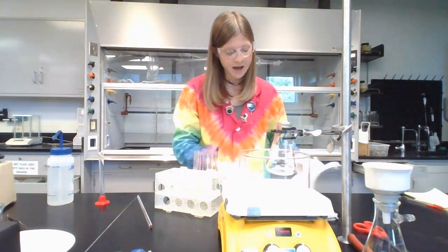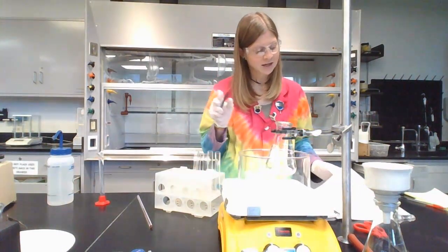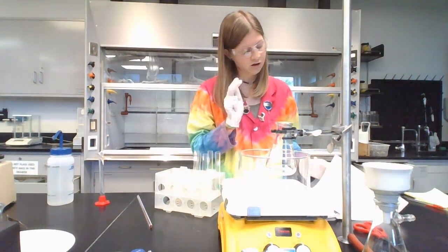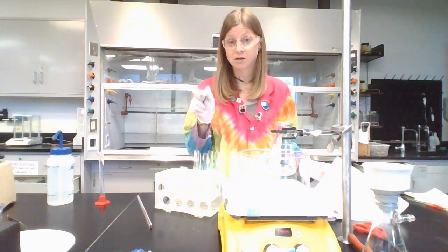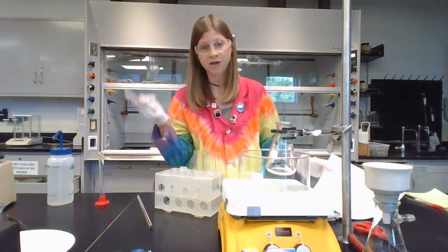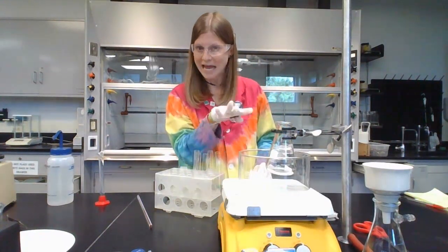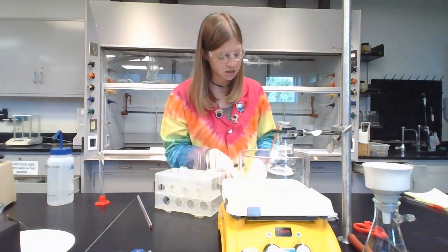So you're going to record that in the phenol test, the color of pure salicylic acid plus FeCl3 and the color of pure aspirin plus FeCl3. The third color test is the color of product, which is what we're calling the thing you made. You haven't finished making it yet, so that'll come later. That's actually the last thing you're going to do, the color test of the product.